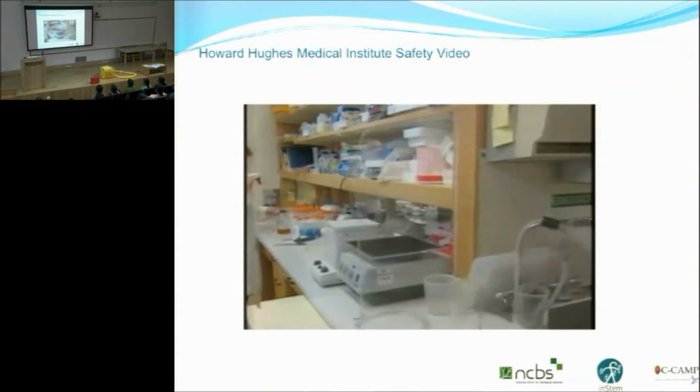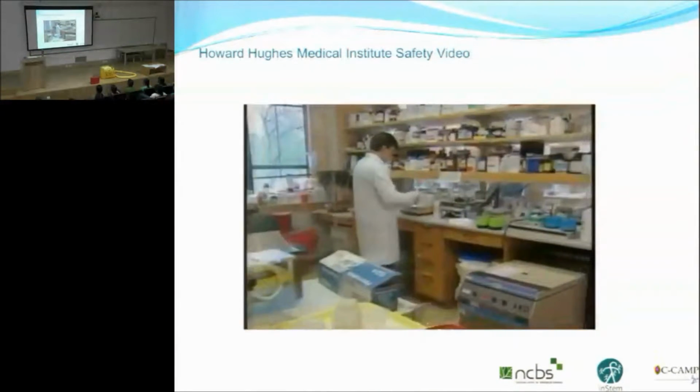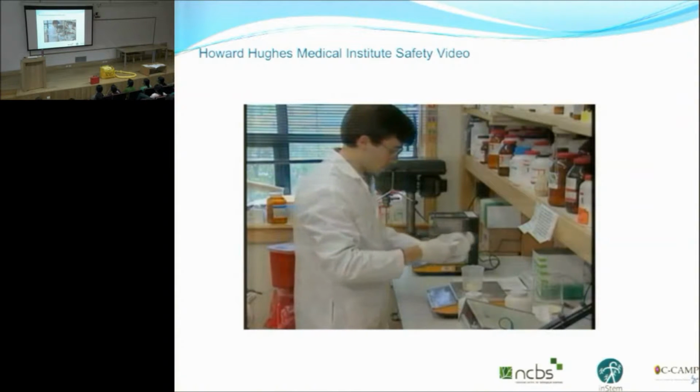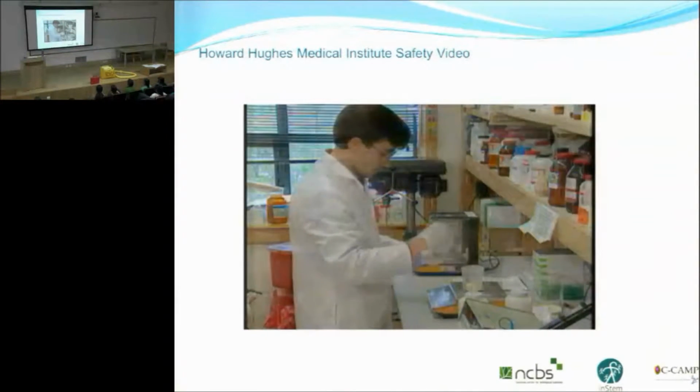The tools of the modern biology laboratory include an arsenal of chemicals. Knowledge of these substances and respect for the potential hazards will allow the research laboratory worker to practice good science safely.